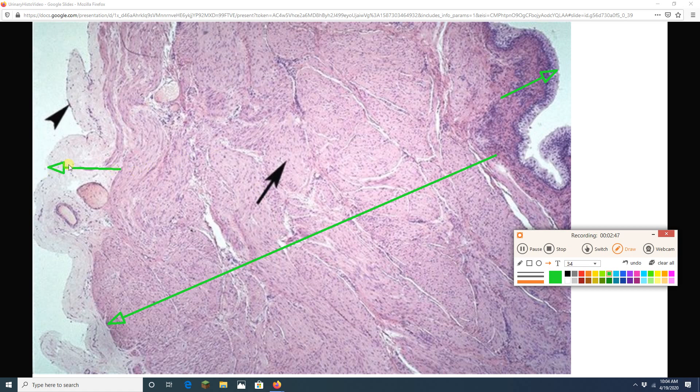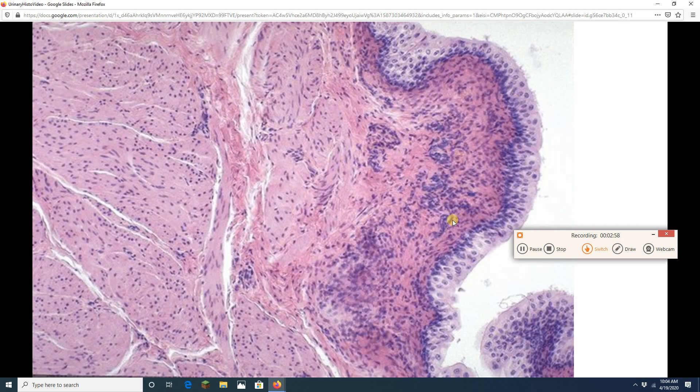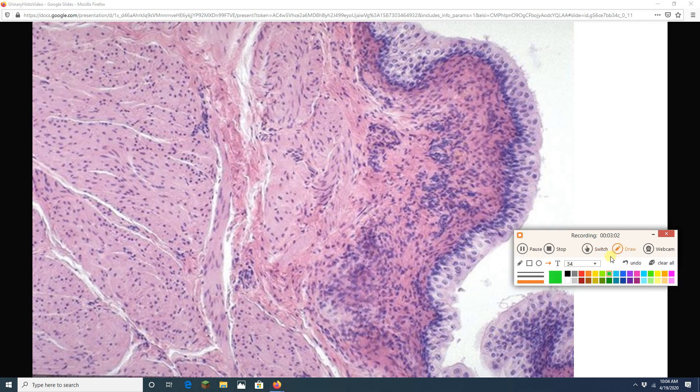And over here I got my adventitia. Remember an adventitia is an anchor that attaches an organ to other neighboring organs. All right. Done with that. Boom. Let's zip on through. Here I have a beautiful mucosa. There are several things I can see.